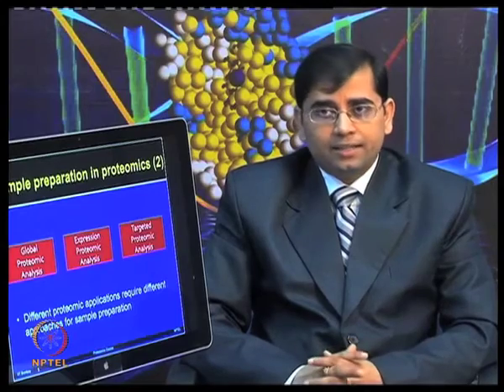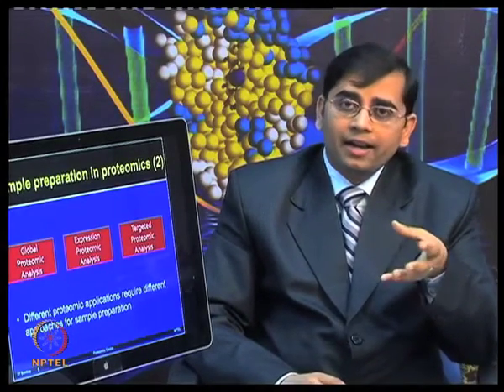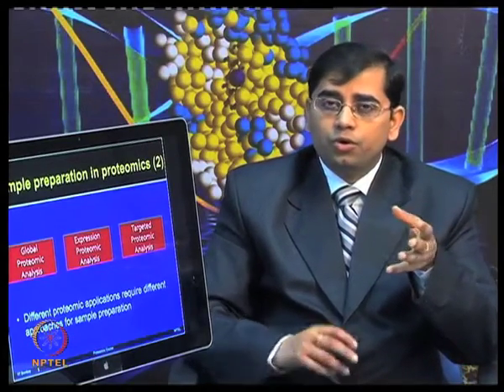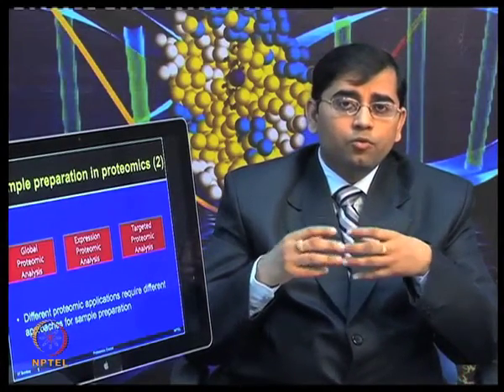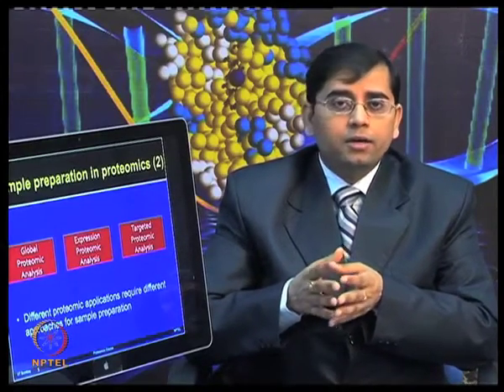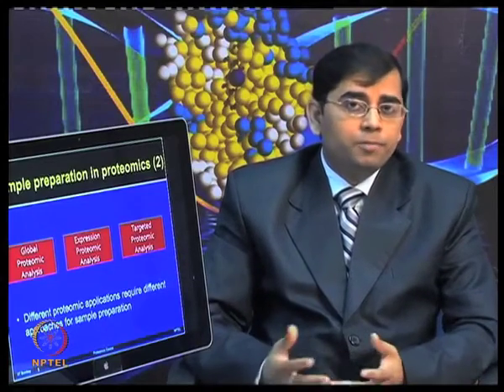Targeted proteomic analysis, if you are very focused on a given organelle or a given sample type, often you would like to know what is happening in that particular proteome, for example, mitochondrial proteome. So, one needs to try different types of strategies when thinking about performing a sample preparation. What is your objective?